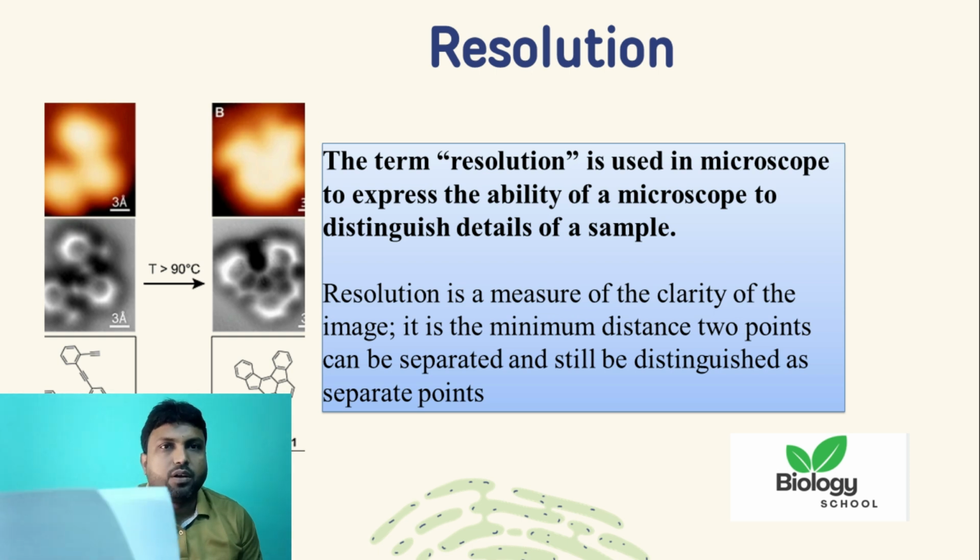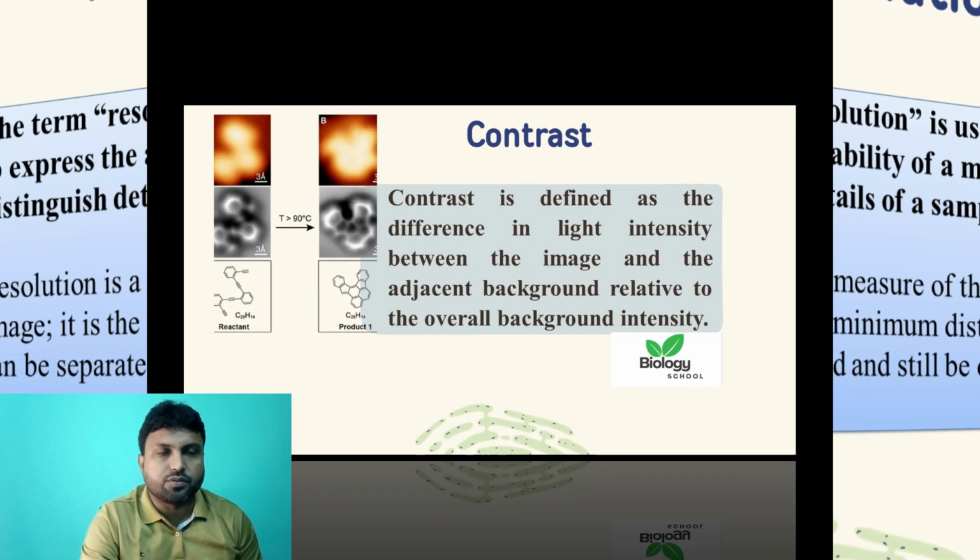For example, what appears to the unaided eye as one star in the sky may be resolved as twin stars with a telescope, which has a higher resolving ability than the eye. Similarly, using standard techniques, the light microscope cannot resolve detail finer than about 0.2 micrometer regardless of the magnification.